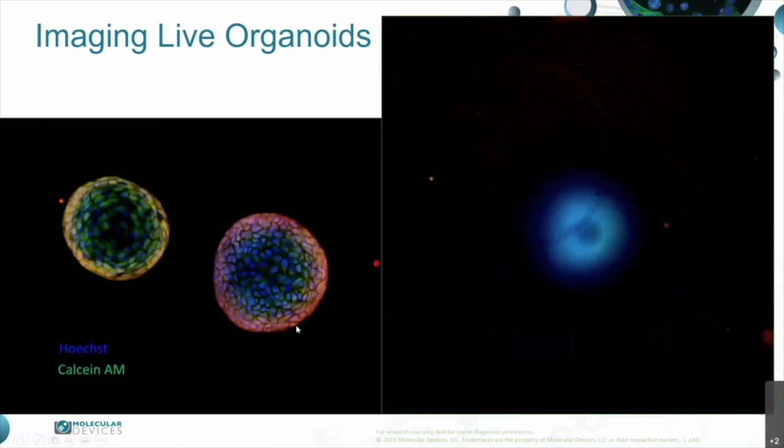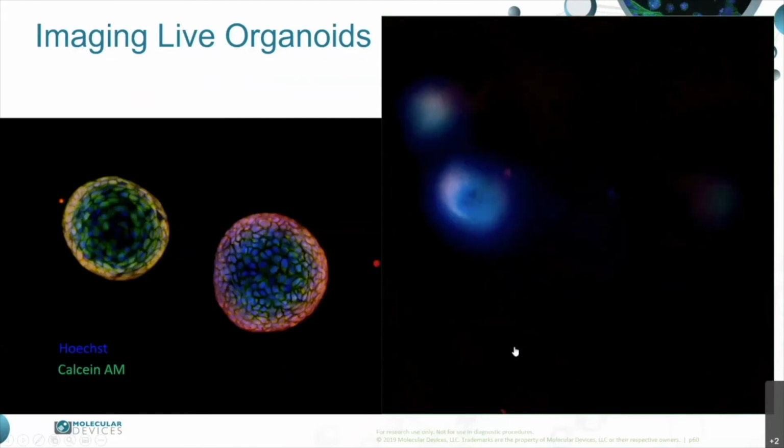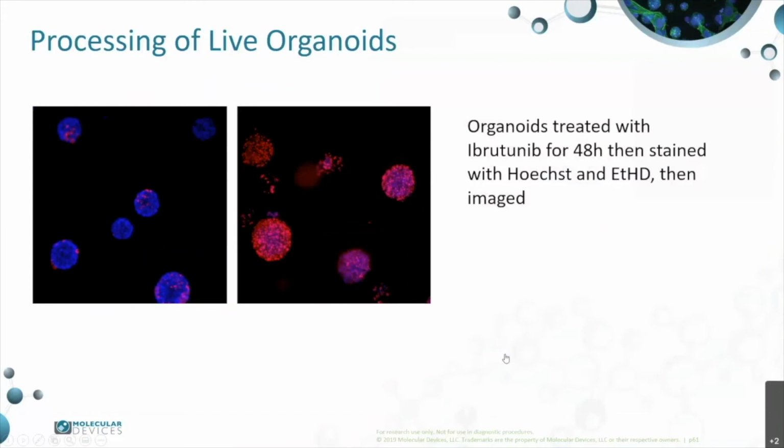And here, this is 3-color stain in addition with mitochondrial stain. And interestingly, you can image those organoids using confocal system, actually pretty precise, and you can see the hollow structure and also complexity of their morphology.